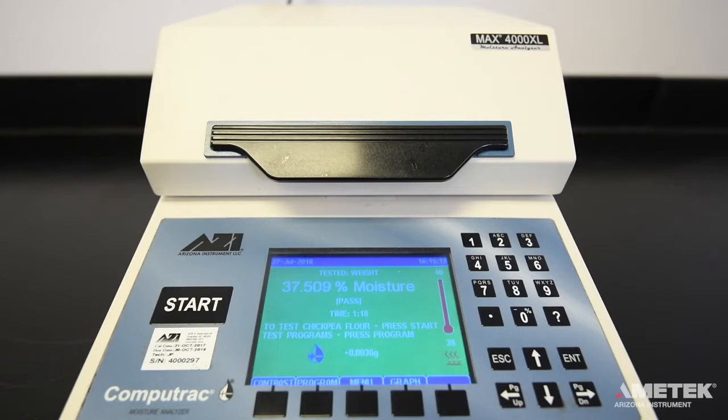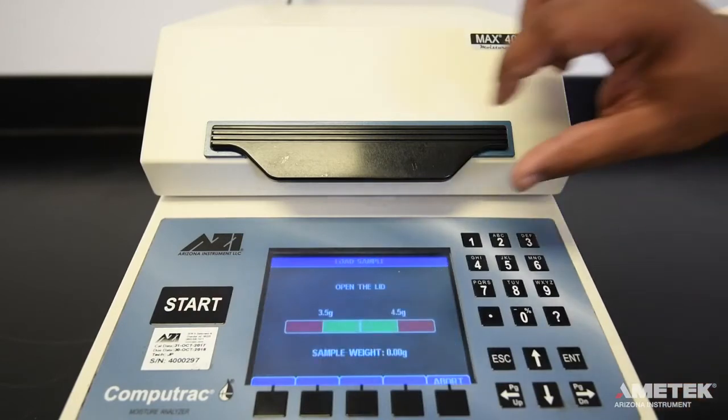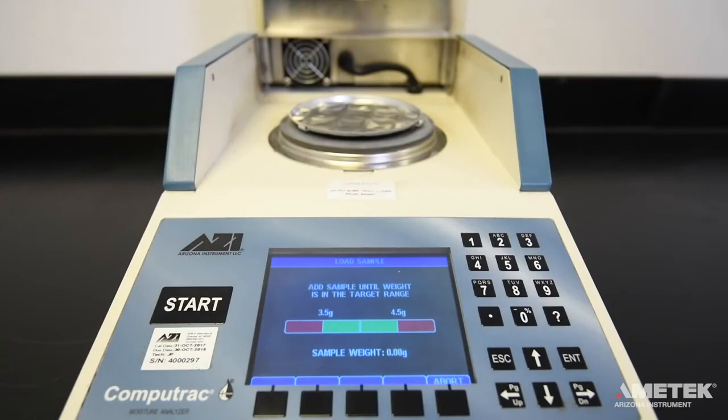Wait for the idle temperature to rise to the desired set point. When the instrument is within two degrees of the programmed idle temperature, it will notify you. Press the start button and follow the on-screen instructions.